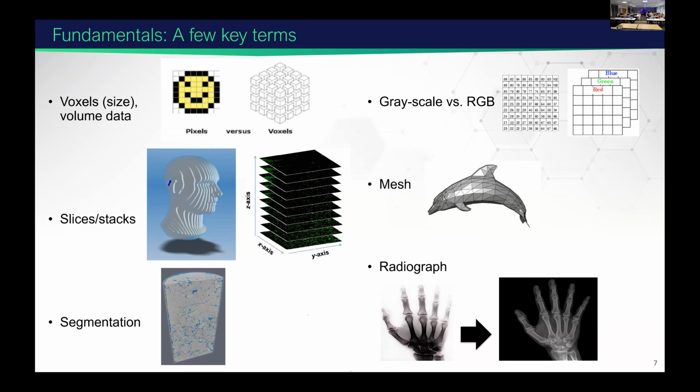And then the radiograph is, you're familiar with this type of medical imaging. The raw X-ray shows the air, low density part as light, and the higher density components as dark. When we reconstruct the images, we see that the colors invert. So now the lowest density part is black, and the higher density part is white.